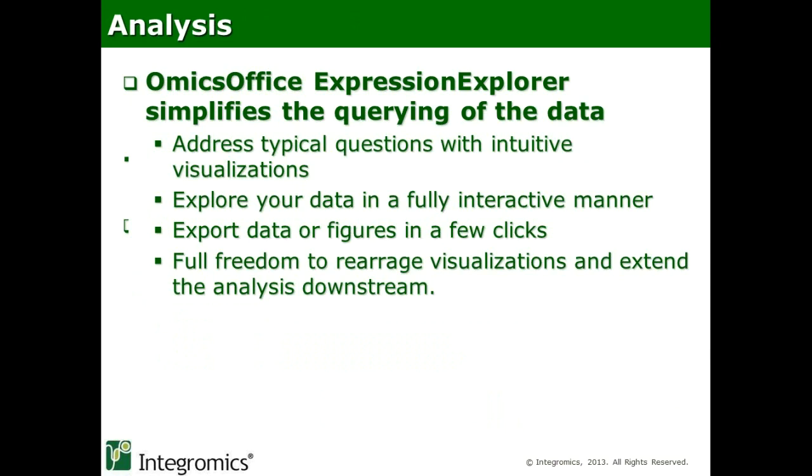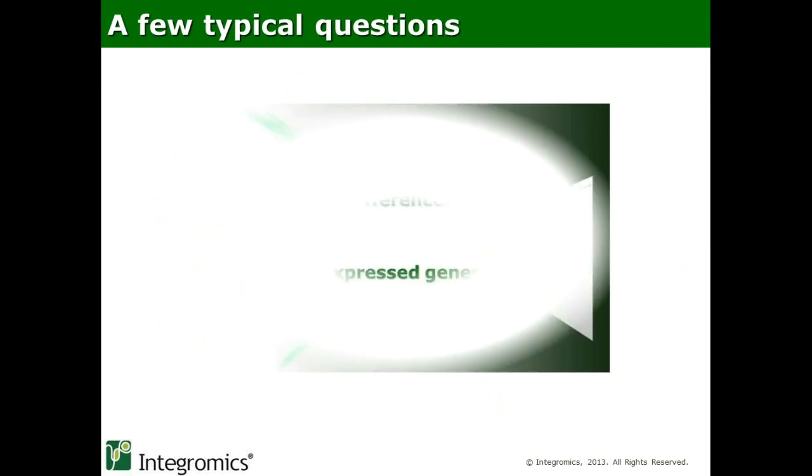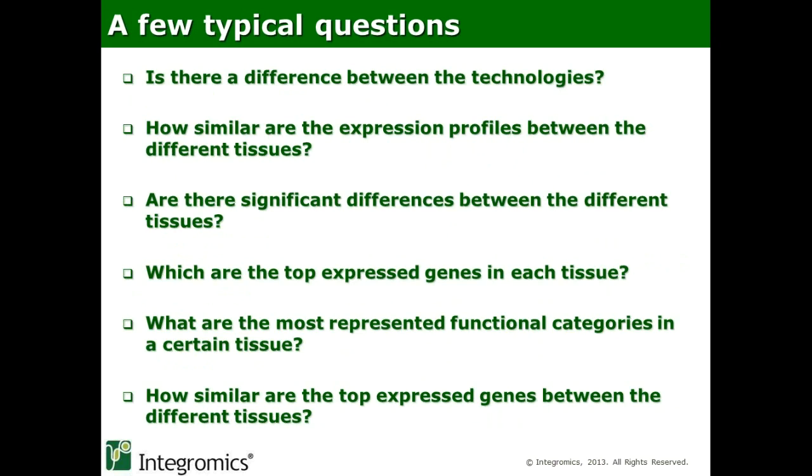So the way we can ask these questions by using ExpressionExplorer is by using the interactivity that it provides us. It provides us with many visualizations that are fully interactive and very intuitive to understand. It's easy to export data and figures. You have full freedom to rearrange these visualizations. And of course, we try to make it as user-friendly as possible, so it's very easy to upload the data and start analysis.